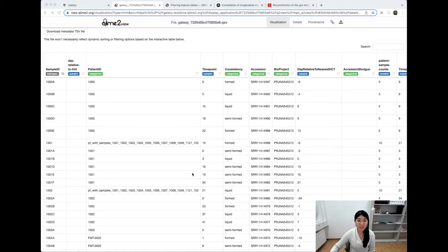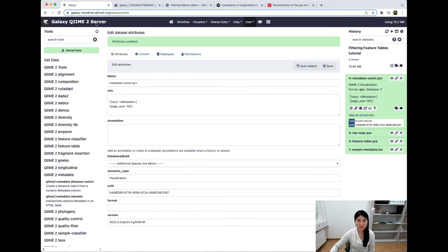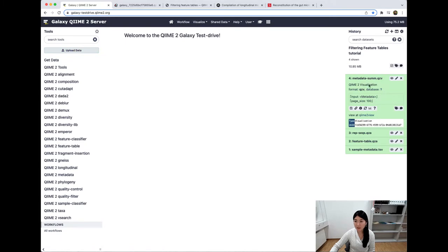Next, we want to generate summaries for the feature table and the ASV sequences. Let's head back to the homepage for our Galaxy server. We still have our feature table and ASV sequences as QIIME artifacts, and we want to generate summaries for both of these. You've already done this during your data import tutorial, but we're working with a new feature table and new sequences here, so let's run the summary again. We want to use the QIIME 2 feature-table summarize tool.